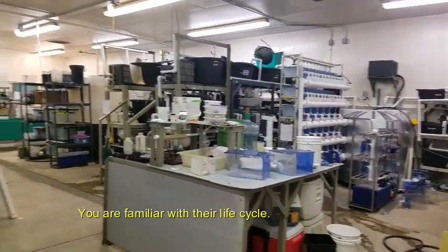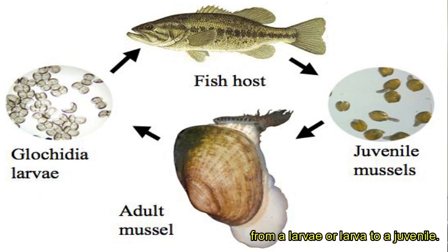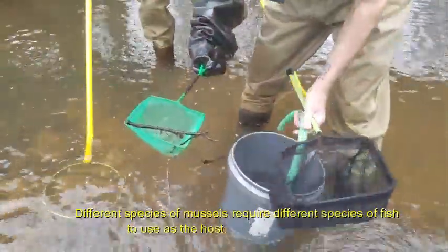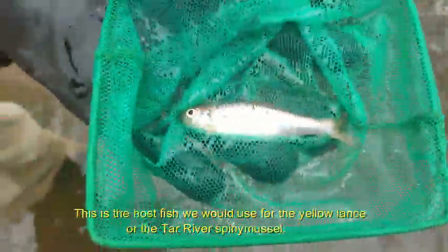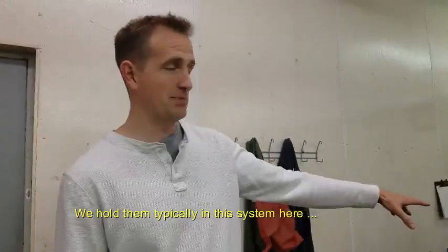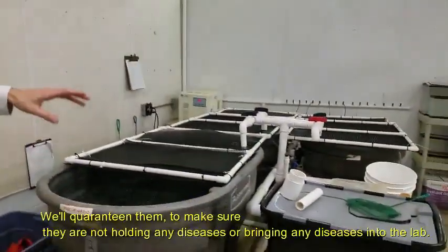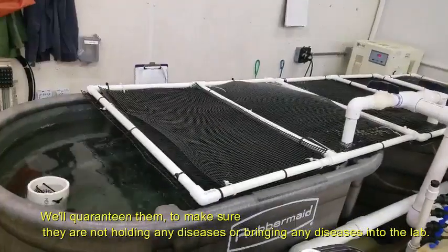If you're familiar with their lifestyle, they require the use of a host fish in order to complete their transformation from a larva to a juvenile. We bring in their host fish from the wild. Different species of mussels require different species of fish to use as a host. This is the host fish we would use for the Yellow Lance or the Tar River Spiny Mussel. We hold them in this system here when they first come in the lab and we quarantine them to make sure they're not carrying or bringing any diseases into the lab.